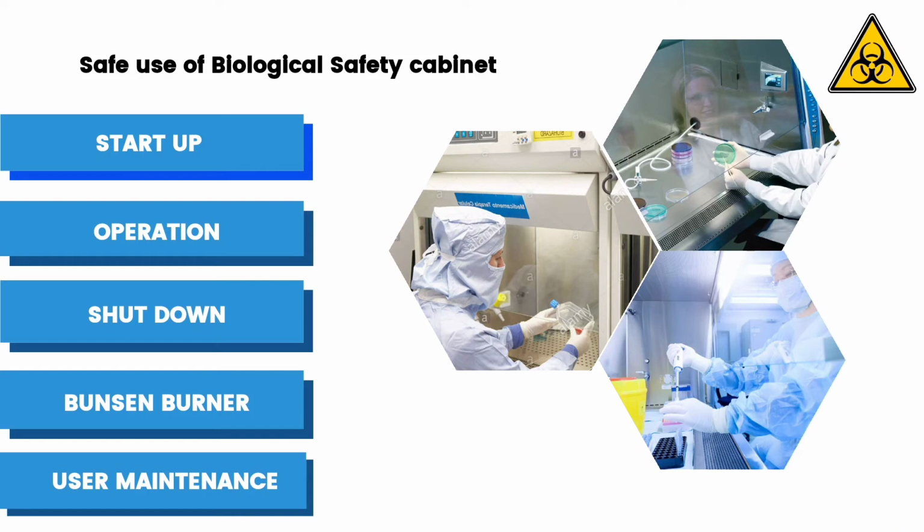Use disinfectant cloths for absorbing any spills or splashes of harmful agents. Keep biohazard bags on one side of the cabinet. Keep devices like centrifuge and pipette trays near the end of rear grill. Avoid using flammable substances inside the cabinet.